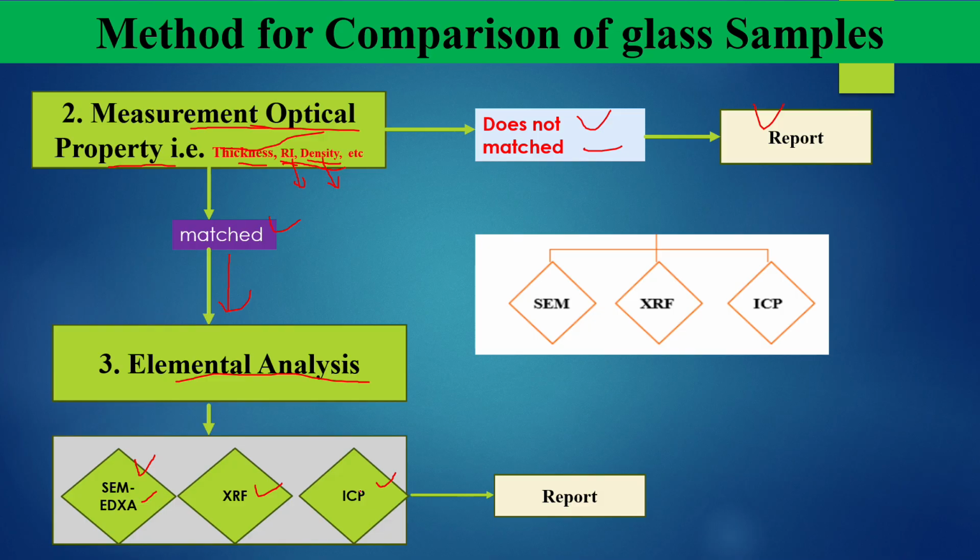I will make a separate video on the procedure used for elemental analysis of glass samples using these techniques. After the elemental analysis, you report whether the samples came from the same source or not.